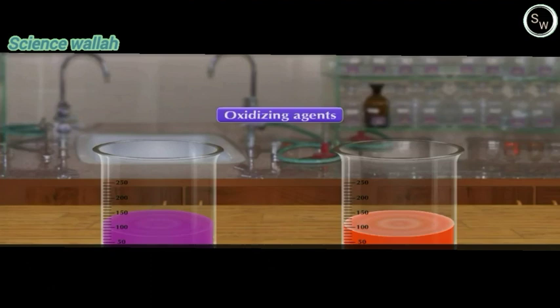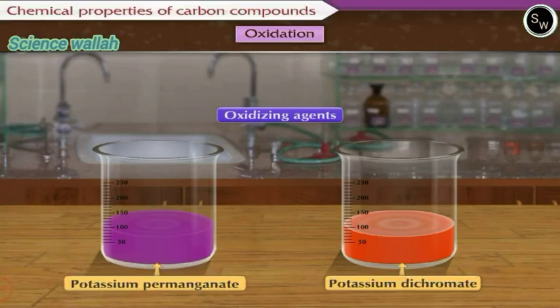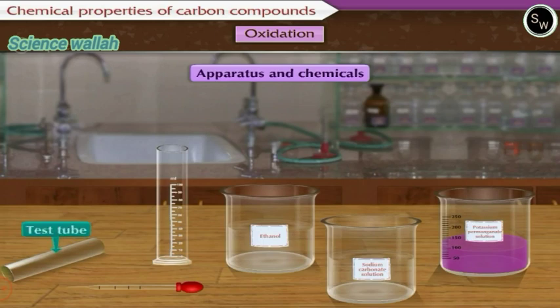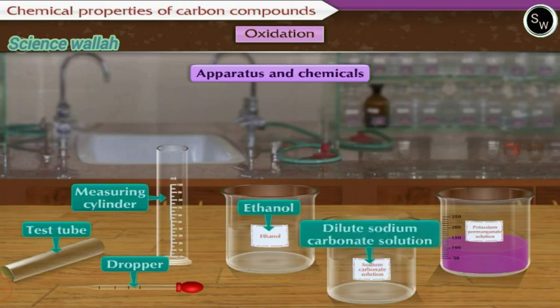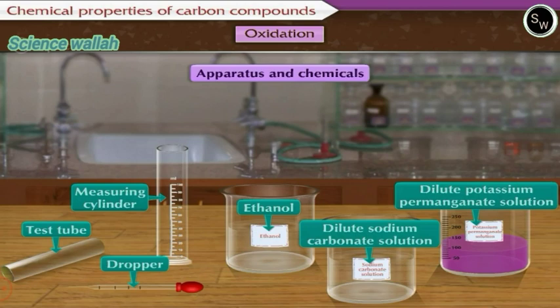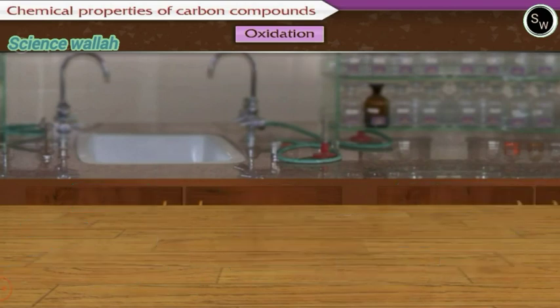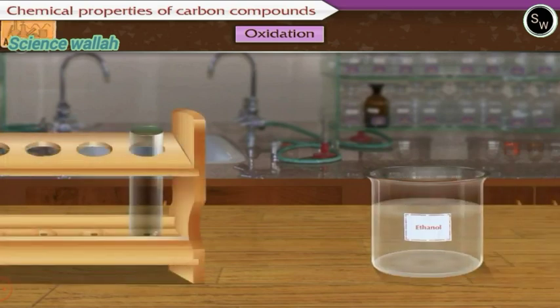To learn more about oxidation, let us perform an activity. Let us first see the apparatus and chemicals required to perform this activity: test tube, measuring cylinder, dropper, ethanol, dilute solution of sodium carbonate, and dilute solution of potassium permanganate. Come, let us perform the activity.